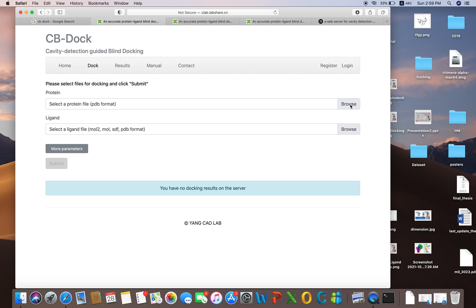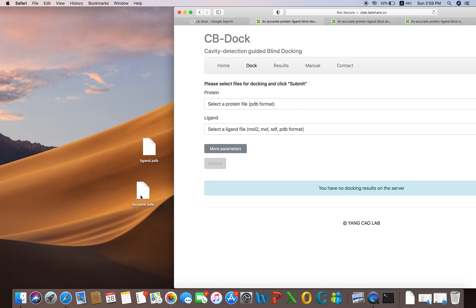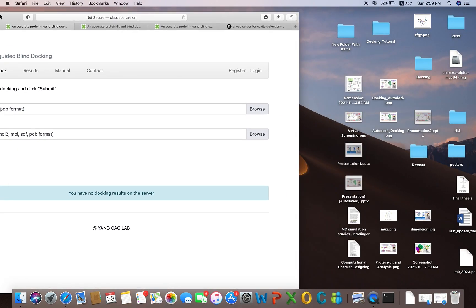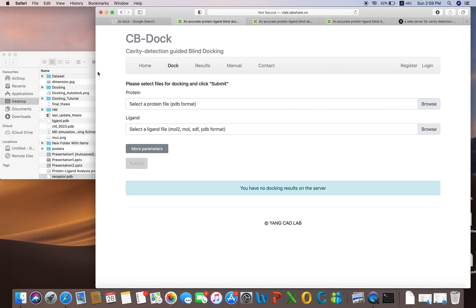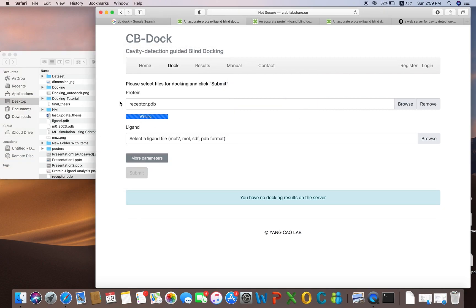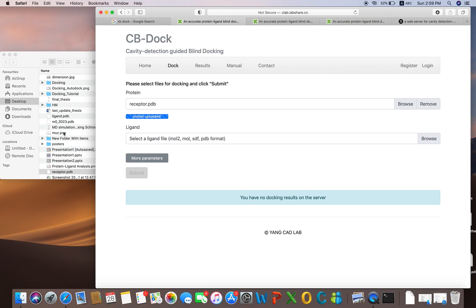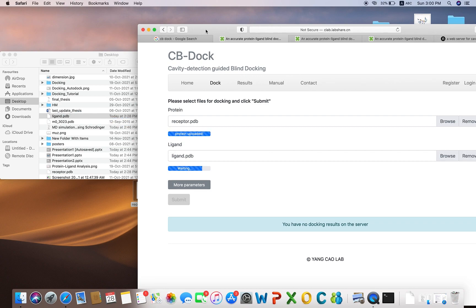We are going to dock our protein and ligands. If you have any protein you can upload it here. I have uploaded my receptor — this is my receptor present on the desktop. I have also a ligand, and both of them are present in PDB format. The server has an automated OpenBabel as well.